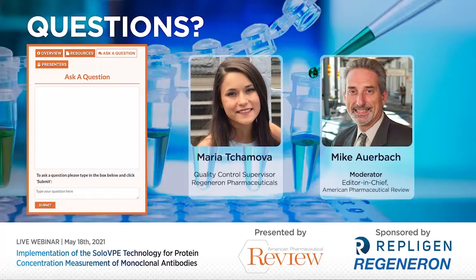Excellent. Thank you. Let's look at our next question. Regarding method transfers to external CMOs, was the process easier due to the technique of slope spectroscopy compared to traditional UV? Yes, absolutely. It is much faster to transfer the slope spectroscopies.